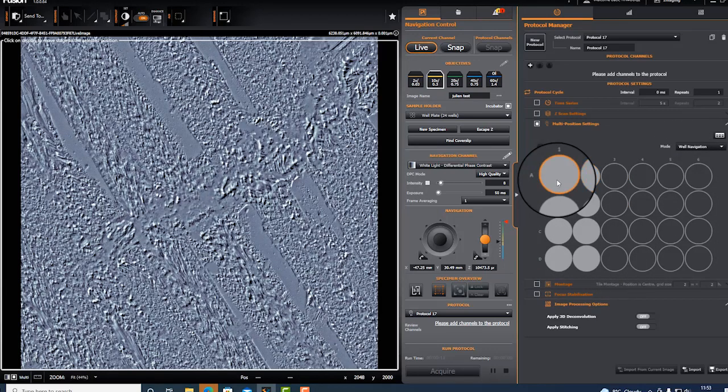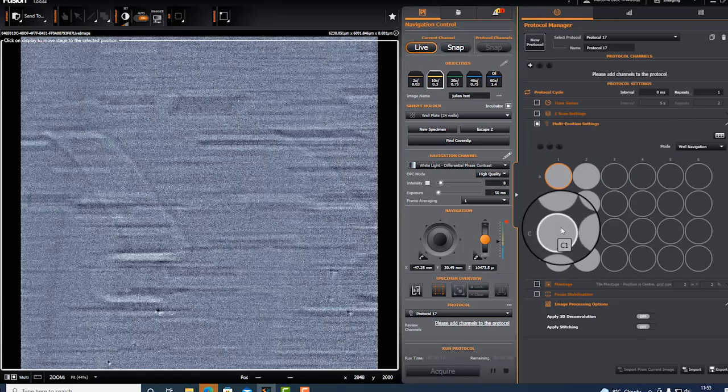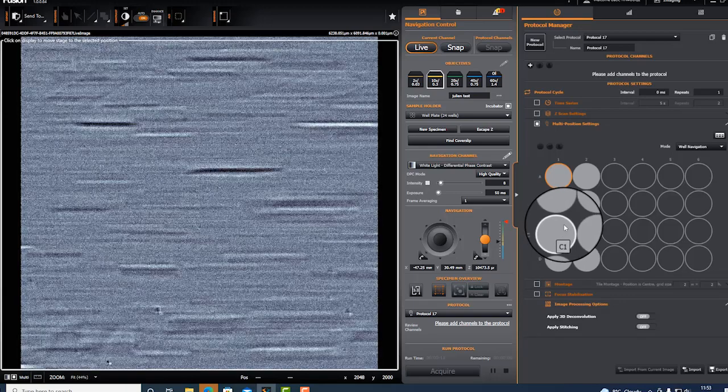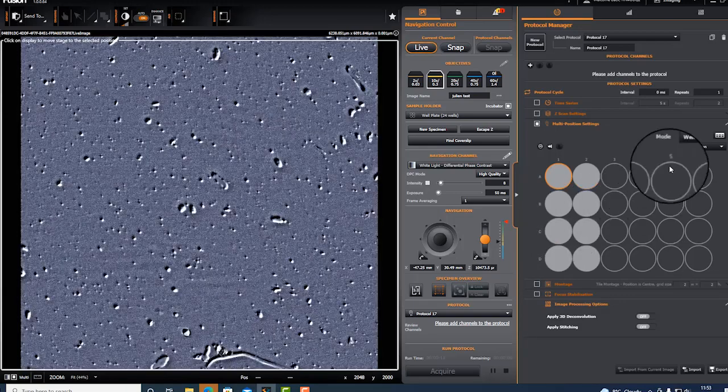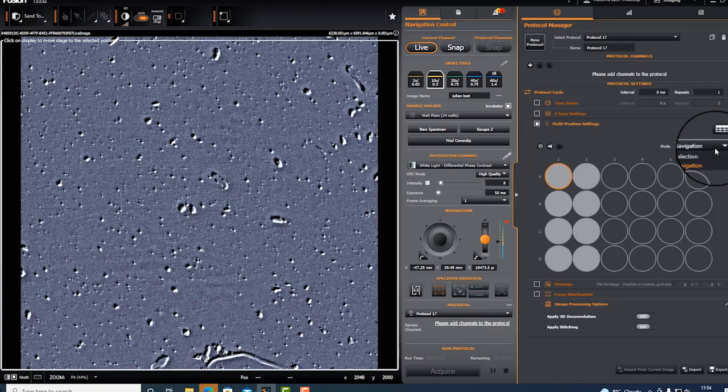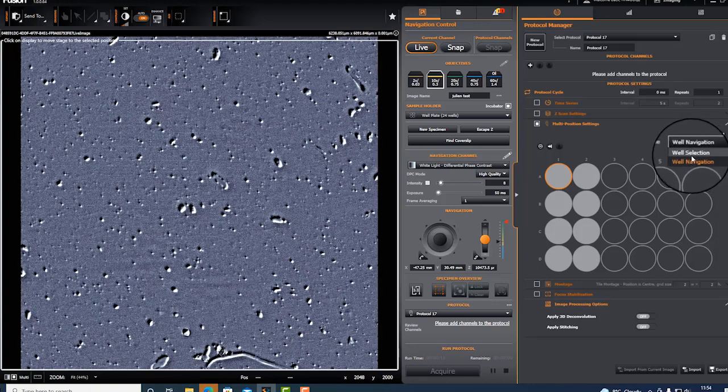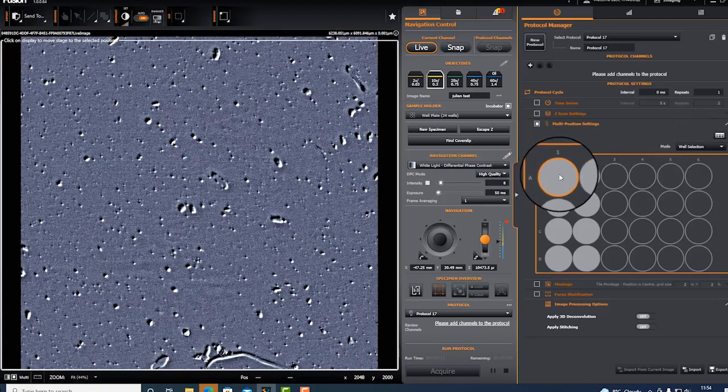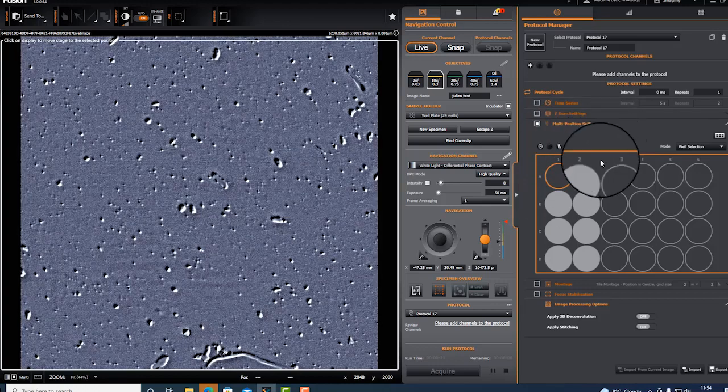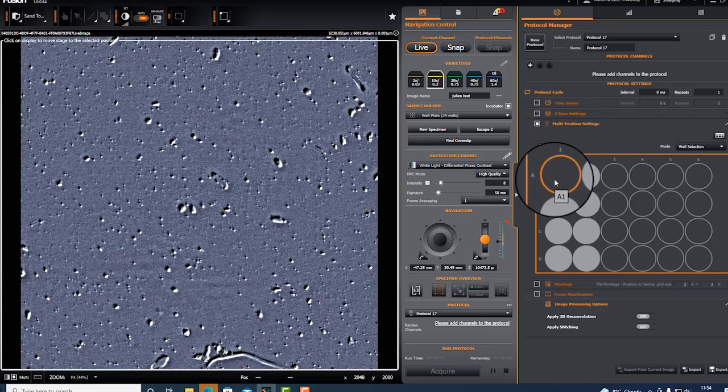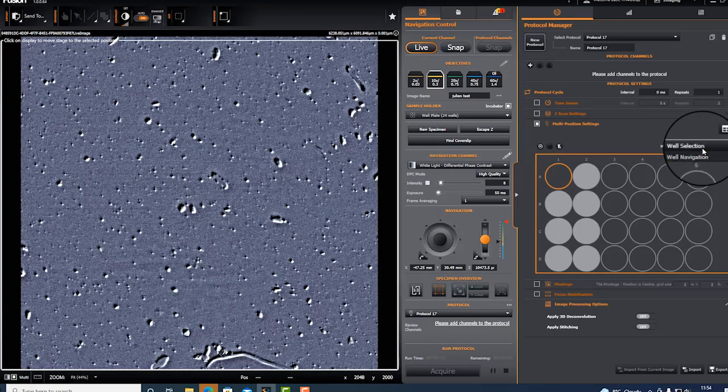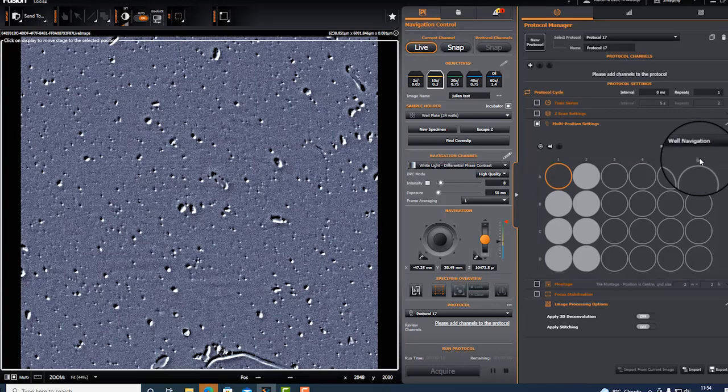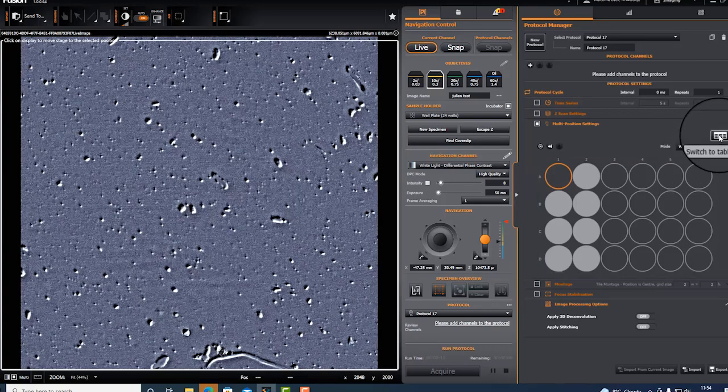Then I can move around the wells but I cannot unselect wells. If I would like to delete wells, I go to well selection. If I now double click, well A1 was unselected. So you can toggle between well navigation and well selection.